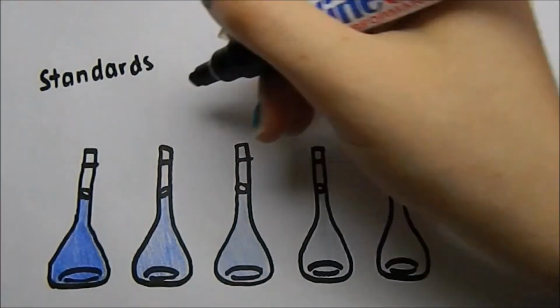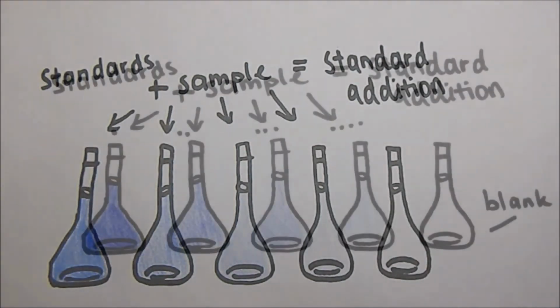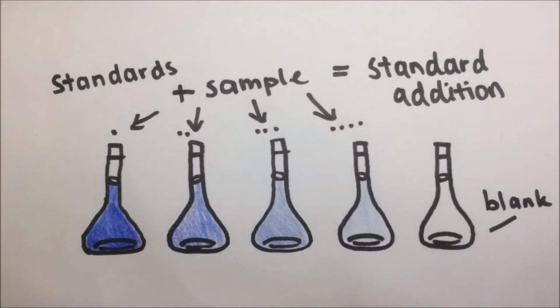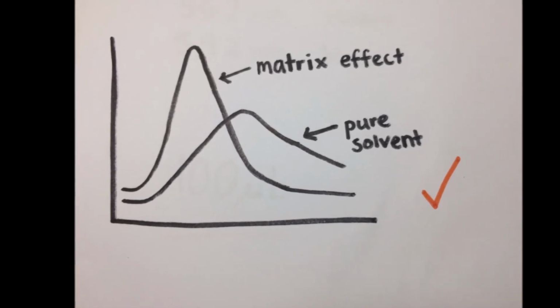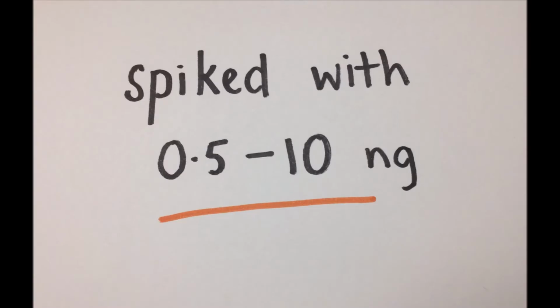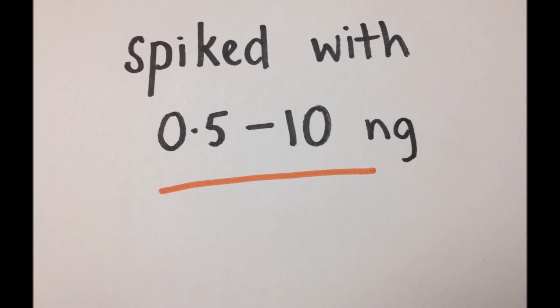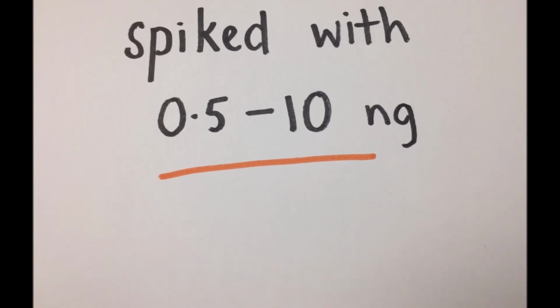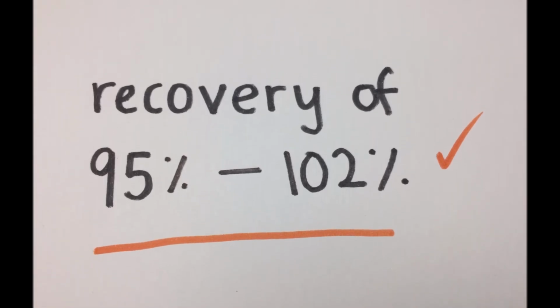For quality control, the collected samples were tested using standard addition with each isolated dye. This was used to eliminate matrix interferences, which is a common issue within the analysis of samples. Overall, it was found there was good repeatability and accuracy of results, as all chromatographic procedures were performed in triplicate. The method was tested by determining the detection limit. This was achieved through spiking the water samples collected upstream from the textile runoff. This was to simulate low dye concentration levels. Good recoveries of the dyes were obtained, confirming the accuracy of the procedure.